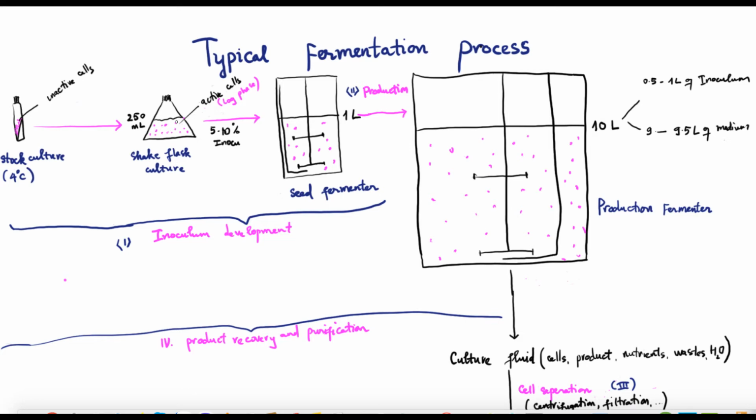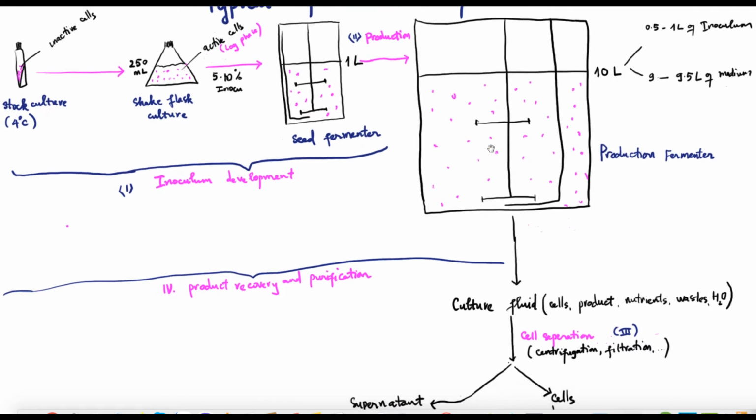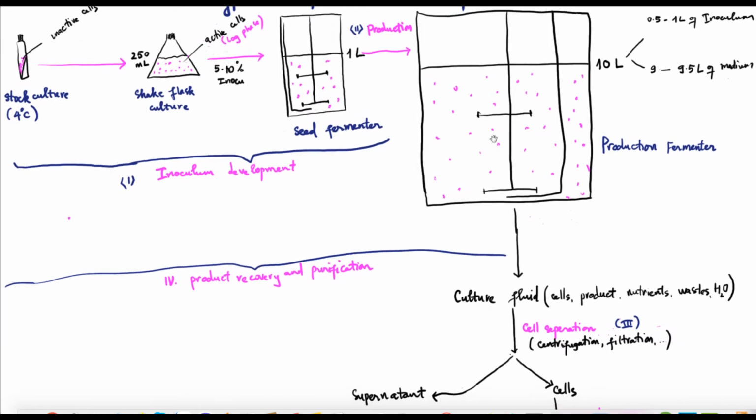If we transfer a small number of microbial cells from a stock culture to a large volume of inoculum medium, then the cells will be too diluted, and that may not be a good starter culture, right? So when you inoculate the inoculum into the production fermenter, the cells will grow and synthesize the desired product.